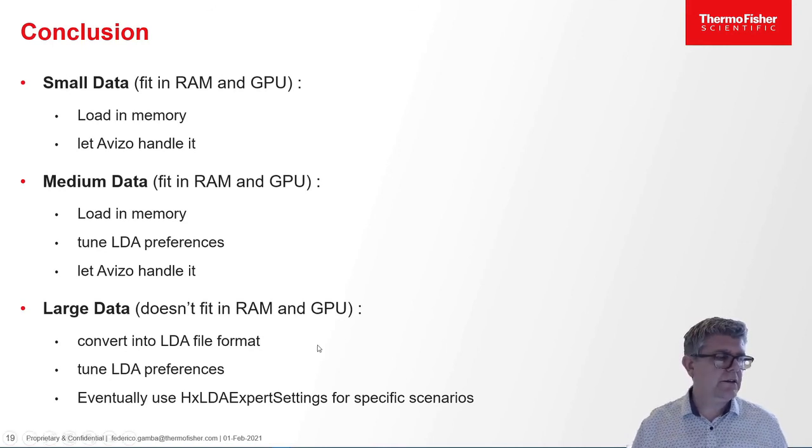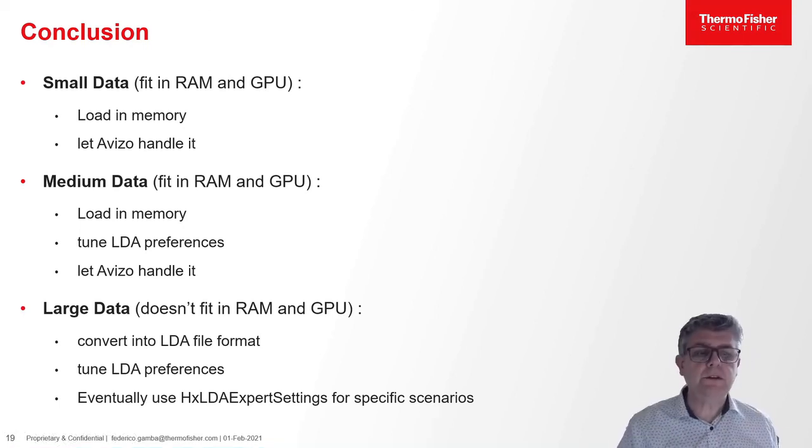And large data, well, you have to convert it to an LDA. You have no choice, and then tune the LDA, and in some cases even go to expert settings. Indeed, you can also use this technique for medium data. This is going to let you spare some memory if you need it for computation. So this is the end of this tutorial. I hope you like it.